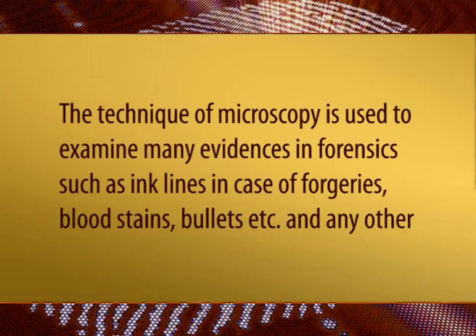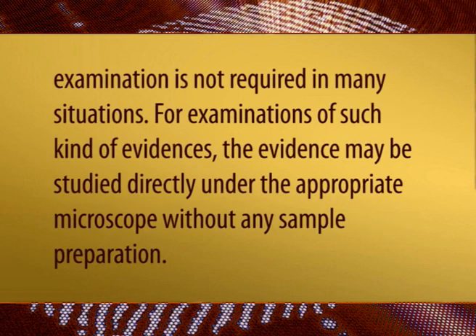The technique of microscopy is used to examine many evidences in forensics, such as ink lines in case of forgeries, blood stains, bullets, etc., and any other examination is not required in many situations. For examinations of such kind of evidences, the evidence may be studied directly under the appropriate microscope without any sample preparation. Based on the investigation required, different types of microscopes are available and used for examinations.